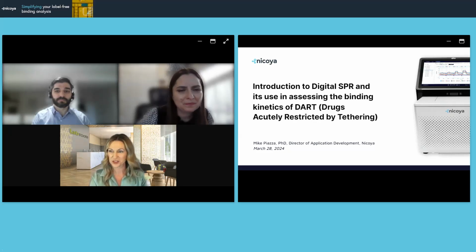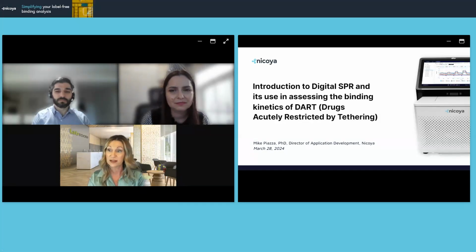Thank you both. Our next question, this one has multiple parts as well. Are the chips reusable after washing? And following up on that question, do you have chips with streptavidin or protein AG that do not have to covalently bind the analyte?